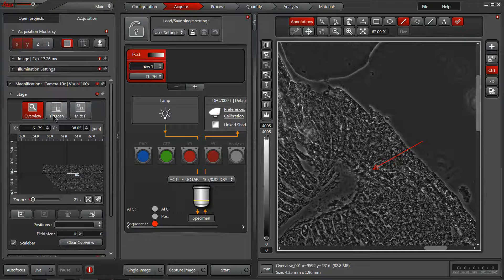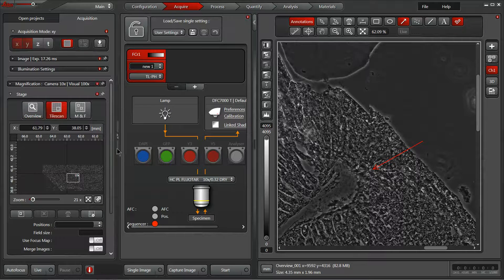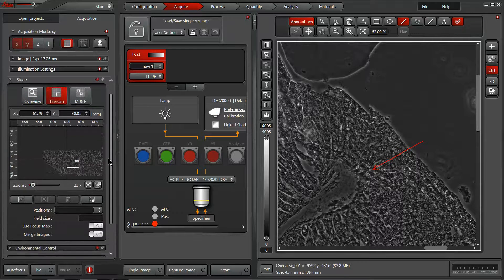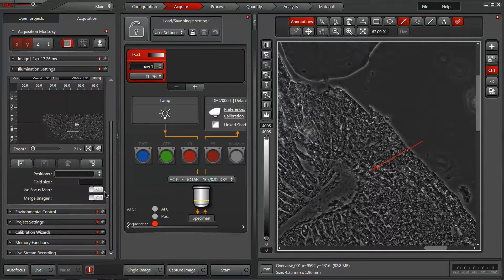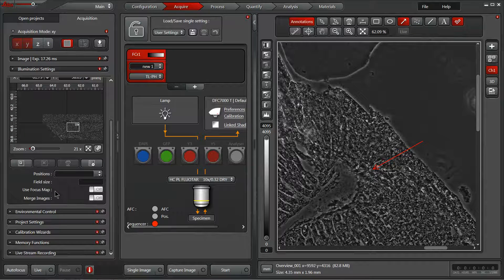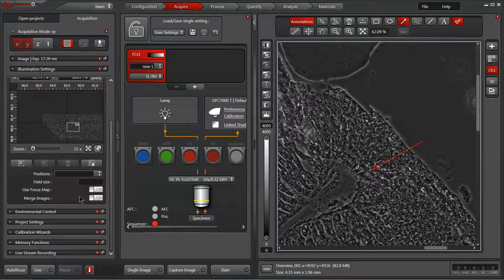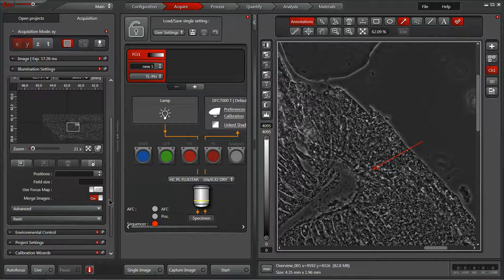To overcome that, we can change to our tile scan modality. Within tile scan, we'll intentionally overlap each imaging field of view so that the algorithm has some landmarks within our sample to use for the merging.